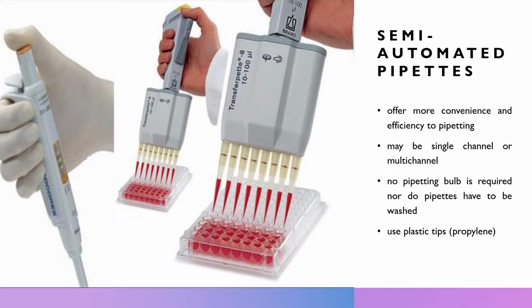A pipette associated with only one volume is termed fixed volume type of pipettes. But most usually, the common or available models of the pipettes are termed variable because we can select here.